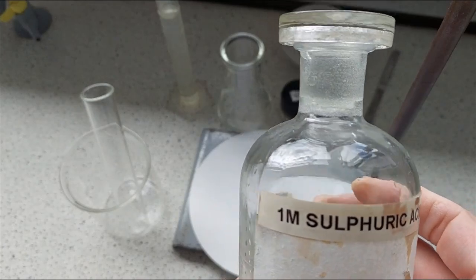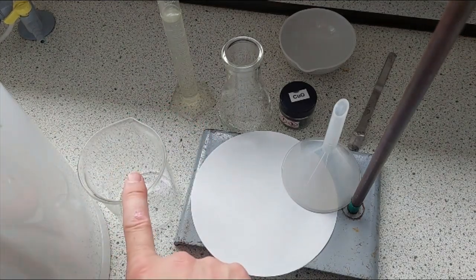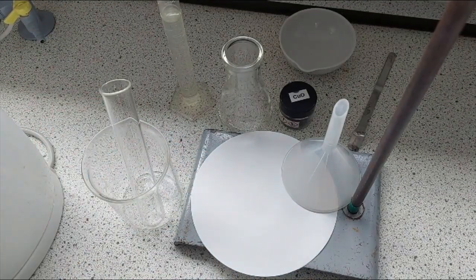It's a 1 molar solution, so it's enough to cause harm to my skin, cause a bit of itching. I'd want to wash it off, but it's not incredibly strong, so the reaction is not going to go forward very quickly. What we'll do to speed up the reaction is use a water bath. Now for the water bath, I'm just going to use a kettle, boil some water up and pour it into a beaker, and then I will place the reaction mixture, which will be in this boiling tube, into there just to warm it up. That will give the particles more kinetic energy, and so they will have more successful collisions in the reaction, and the reaction will proceed at a faster pace.